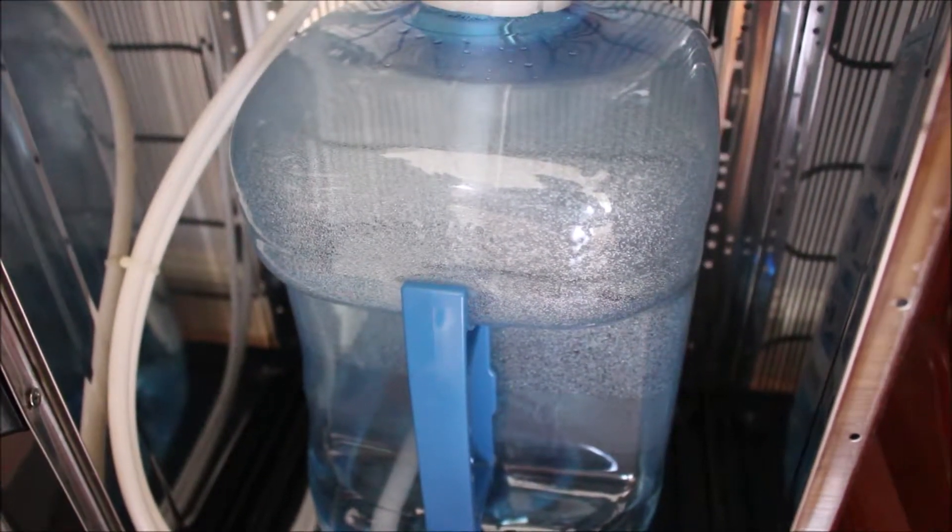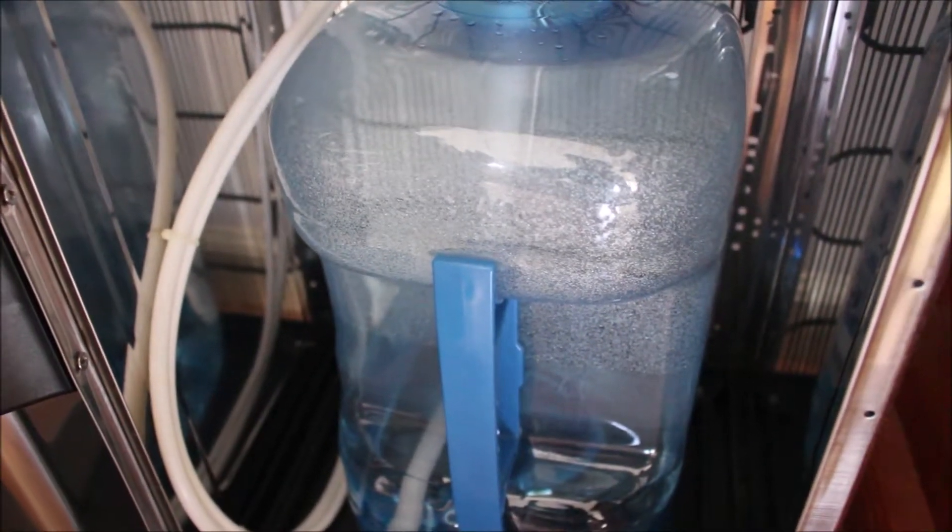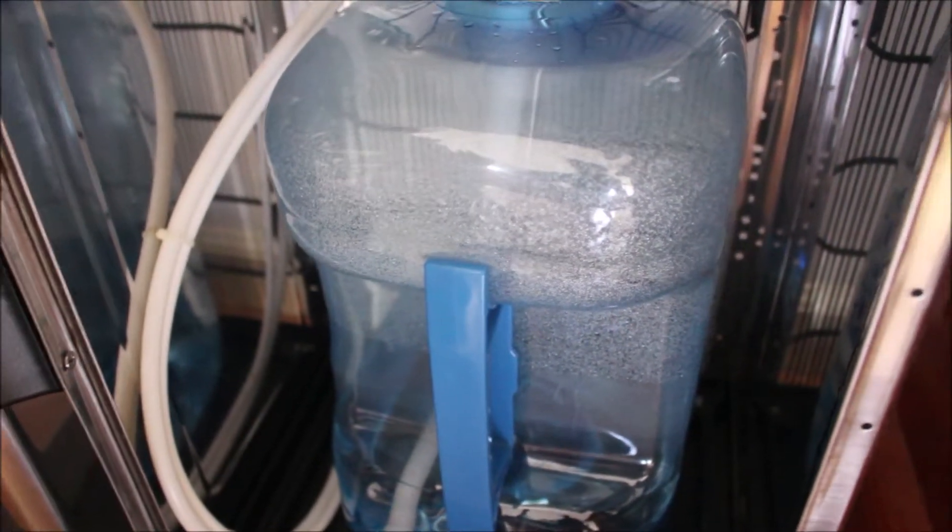Hey everyone, what's up? Today we're doing a pH water test on these purified waters that I buy for home. I wanted to see if it was alkaline, neutral, or acidic. So let's do a test on it.